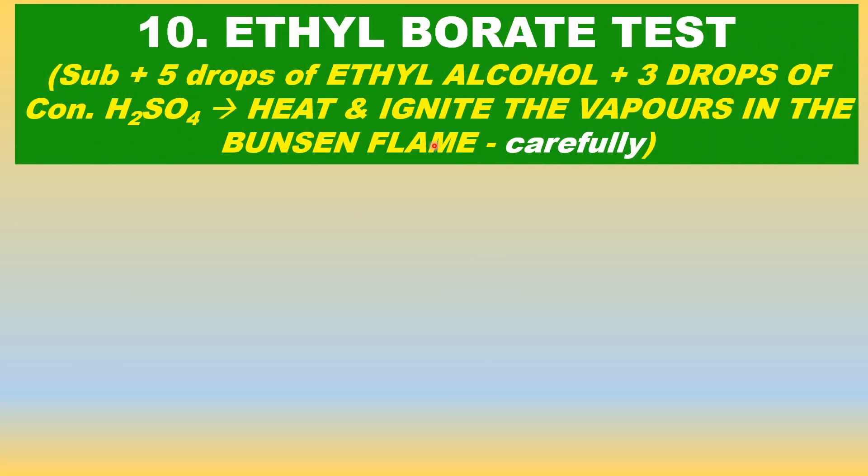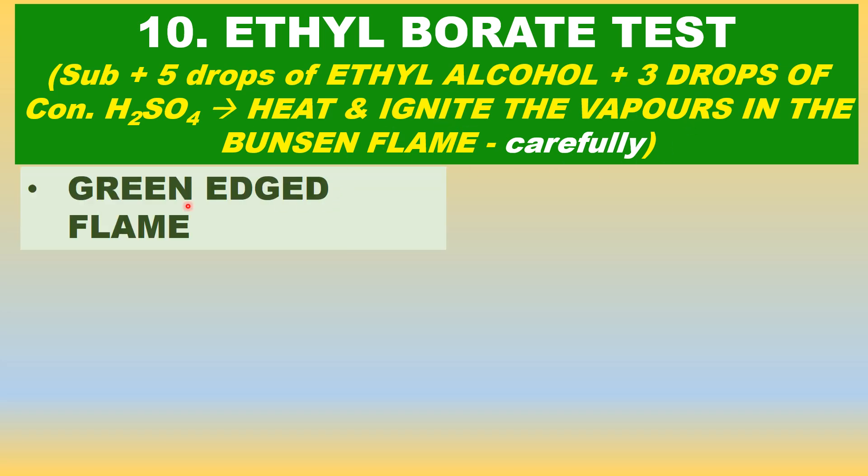Let us now see an interesting test for borate: the ethyl borate test. Take a small amount of substance in a test tube. Add 5 drops of ethyl alcohol only — don't add too much, it will catch fire — and 3 drops of concentrated sulfuric acid. Heat gently. Ethyl borate vapors will come out. Show the vapors to the Bunsen flame.